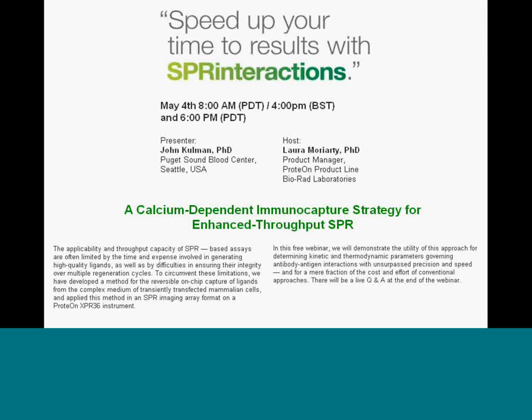So as Laura alluded to, I'm going to discuss a couple of things today. The first is this idea of calcium-dependent immunocapture, which is a new way of doing SPR that we've developed here at the Puget Sound Blood Center. And then in the later part of my talk, I'm going to get into how the ProteOn can be used to enhance the throughput. This is particularly important because in our experiments we're trying to do thermodynamic analyses, which involve doing SPR experiments over a range of different temperatures, all of which takes time. So in order to get our data in a reasonable time frame, we wanted to enhance our throughput, which we were able to achieve with the ProteOn.